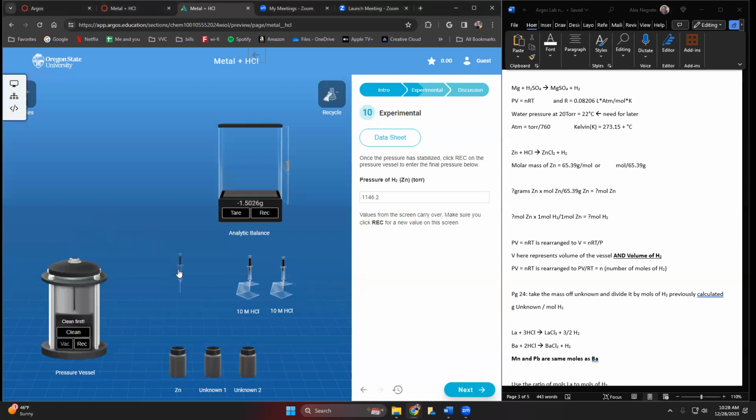So here, you can actually just go ahead and place that back down here, but you'll see now that the record button is available. Just be patient, let the reaction take place. Could take 3 minutes, could take 5 minutes, could take 10 minutes depending on your computer. But just go ahead and let that reaction take place.